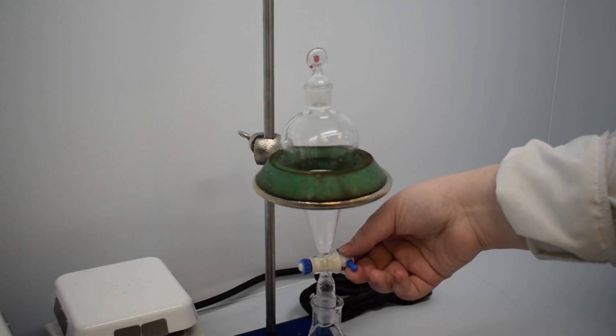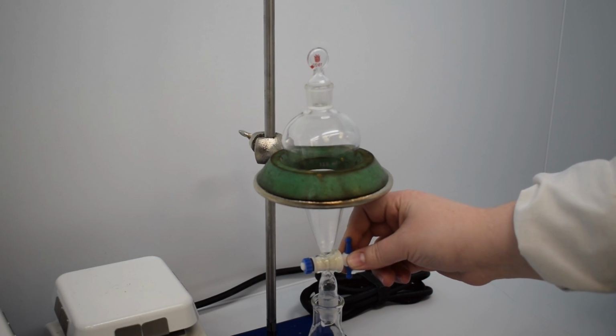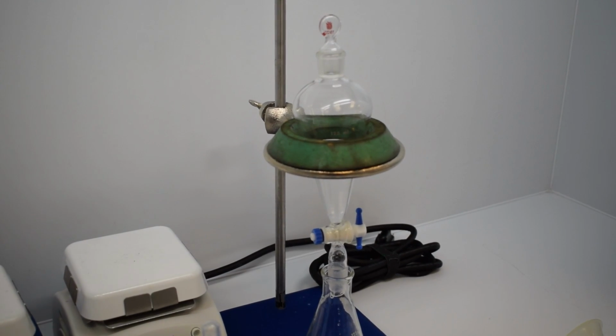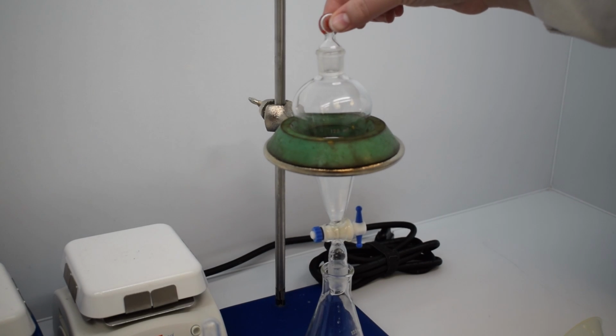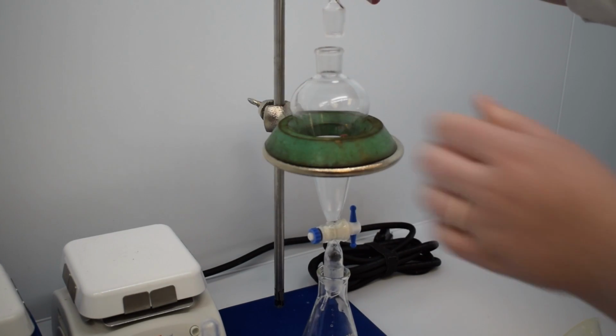With the separatory funnel back in the iron ring, we can draw off the bottom aqueous layer into an Erlenmeyer flask. But it's not draining. If you notice, someone has left the cap on. Make sure you remove the stopper from the separatory funnel before trying to drain off your aqueous layer.